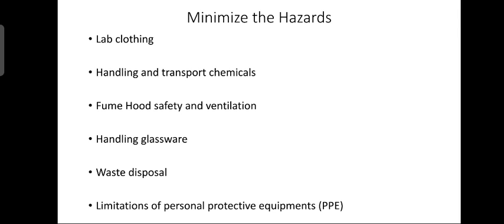Now, let us see handling glassware. Glass breakage is a common cause of injuries in laboratories. Only glass in good condition should be used. Protect hands with leather gloves when inserting glass tubing. Hold elbows close to the body to limit movement when handling tubing. Conventional laboratory glassware must never be pressurized or used with vacuum.